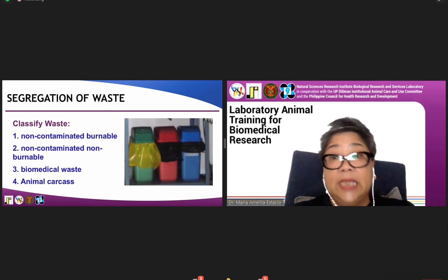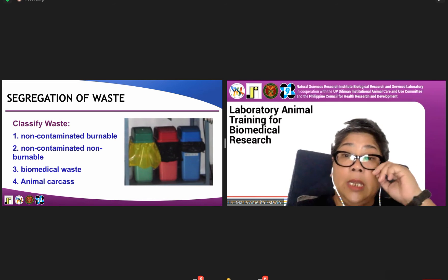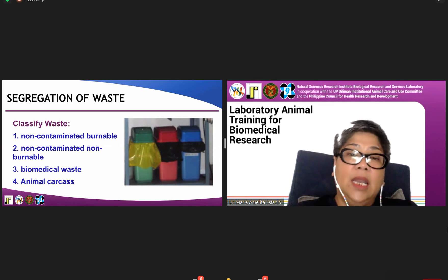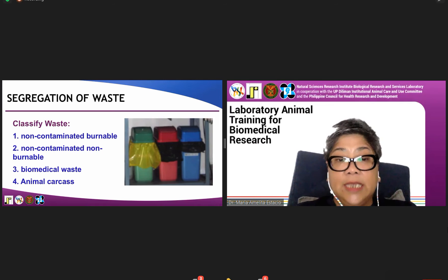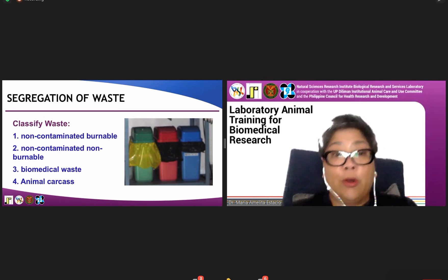This is how we segregate our waste. We have color-coded garbage containers with the appropriate garbage bags. We segregate them as non-contaminated burnable, non-contaminated non-burnable, biomedical waste, and animal carcass. This classification of waste will be discussed in detail by Dr. Katap or Dr. Hernandez.